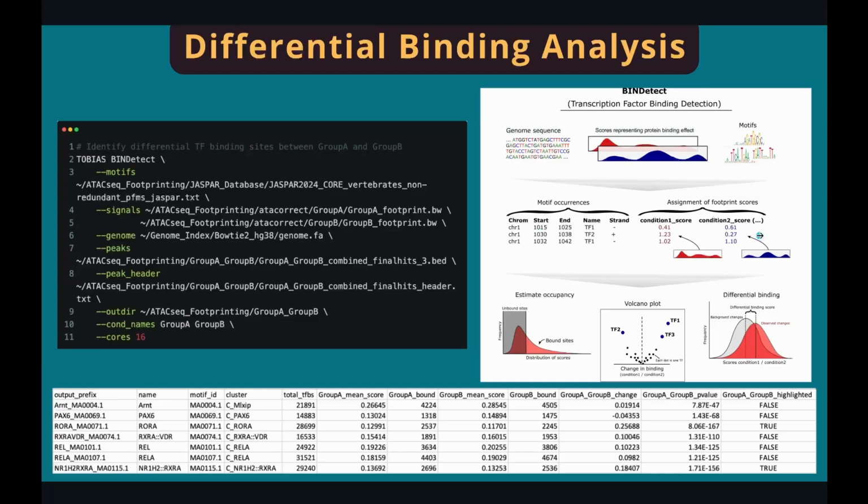The results contain multiple plots and tables, the different tables in this format. It also contains a volcano plot in HTML or PDF format.